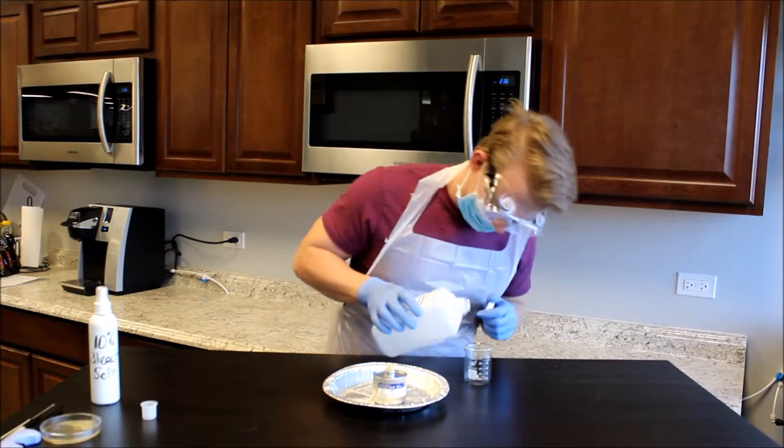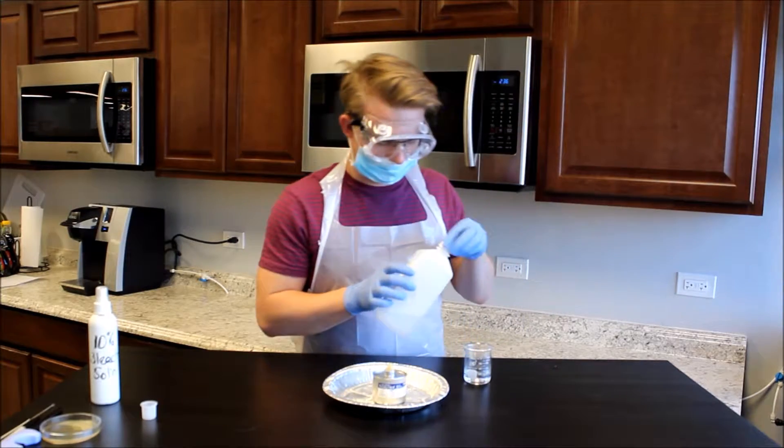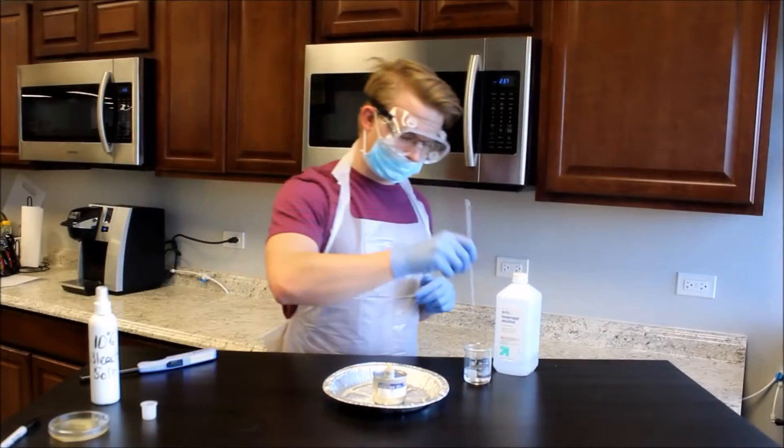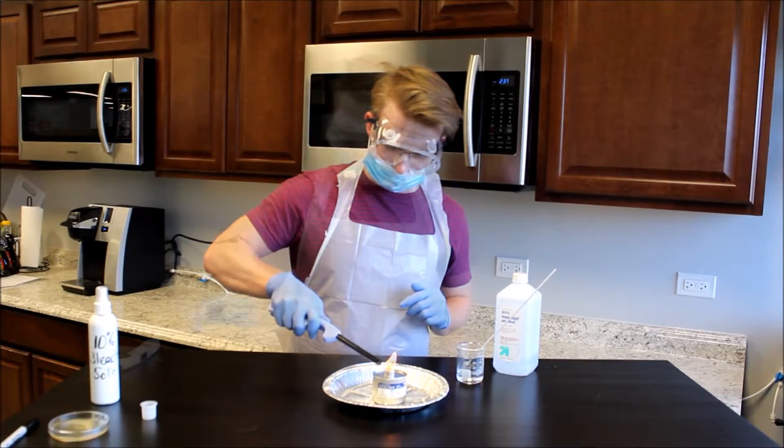Pour 25 ml isopropyl alcohol into the 100 ml glass beaker. Place the metal inoculation loop into the beaker of alcohol. Light the burner canister.